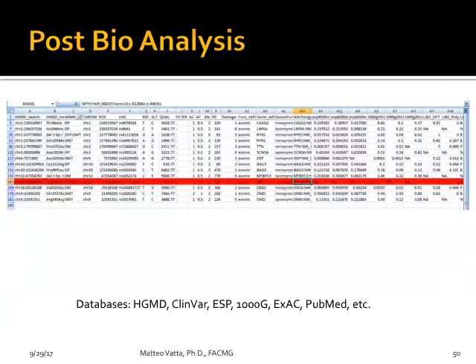So you need to know, of course, the chromosomal position, the position relative to the genome where a variant occurred, and then it would be great to link to several databases. For instance, a database called HGMD, or Human Genome Mutation Database, which tells you if this particular variant has been published before. And if there is literature attached to the variant, it's important because you can go to that literature and analyze the evidence that is presented and see if it helps your classification.